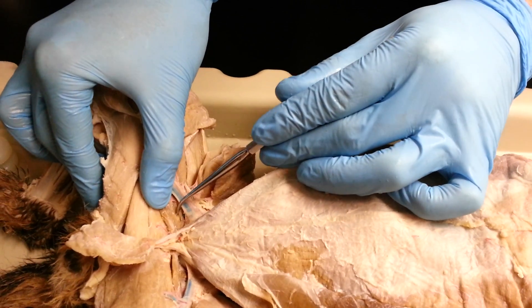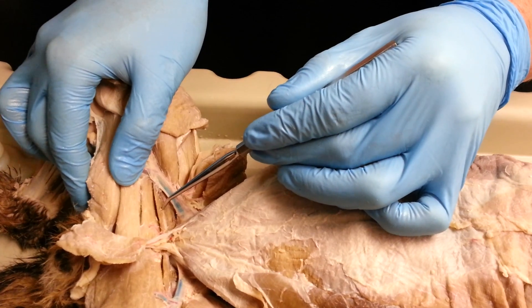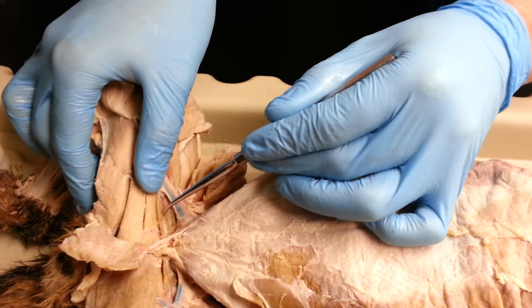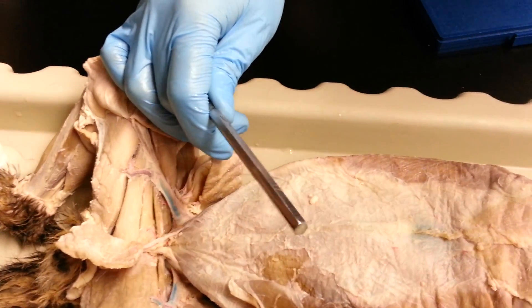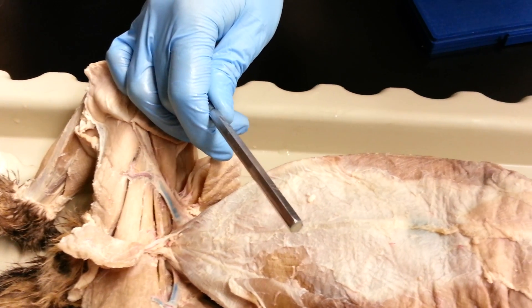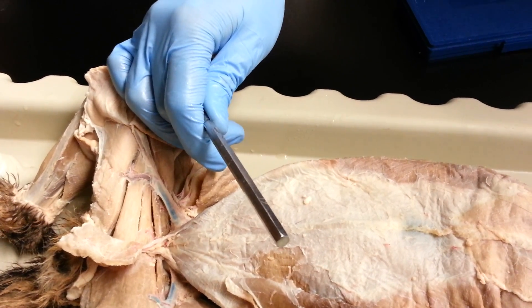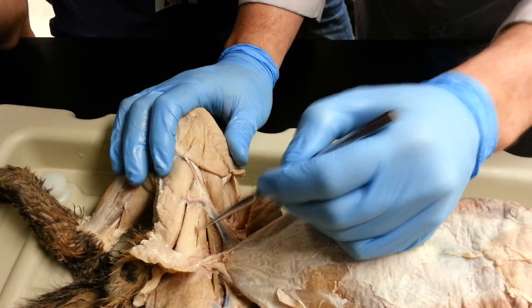The pectineus is really tough to see — it's tiny in there. This one right here is the adductor longus, and then this one is the adductor femoris. This is the adductor longus and this is the adductor femoris.